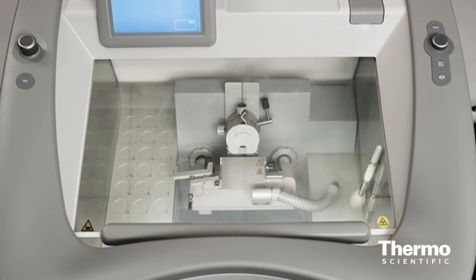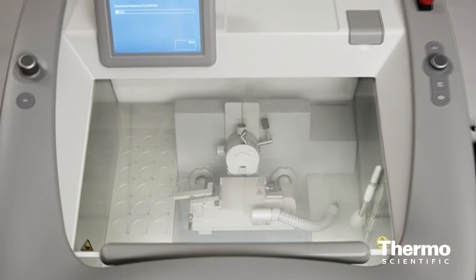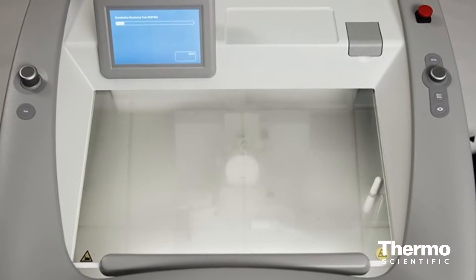It also offers an optional cold disinfection system. If you're familiar with that from our other cryostats, it fumigates the chamber cold, so it can do it more quickly than with other systems, and does it completely because it gets into all areas of the cryo chamber.